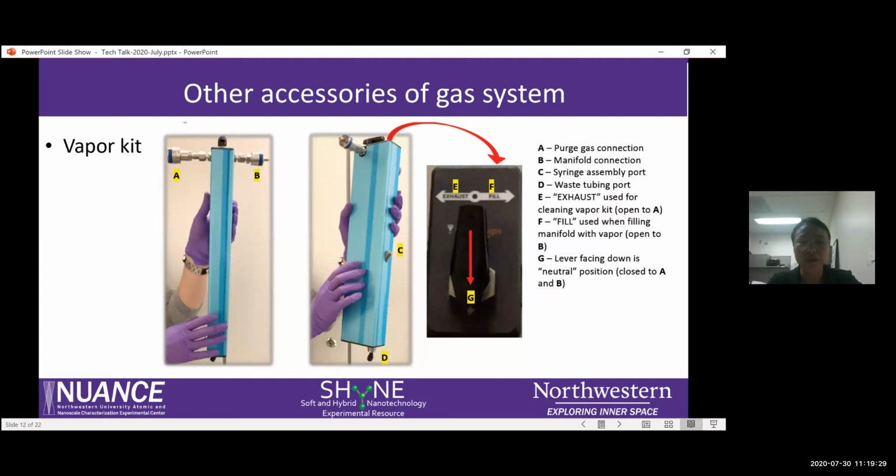We also have some vapor capability, like you can do water vapor, ethanol, or methanol vapor. But if you do the vapors, the pressure cannot reach above 1 atmosphere, because we know that at 1 atmosphere, water cannot maintain the vapor state. It will become liquid.